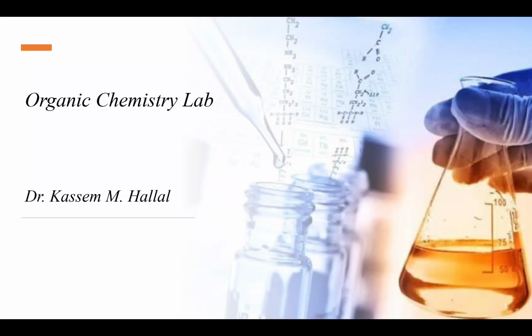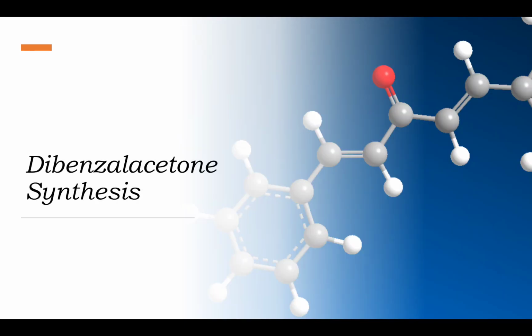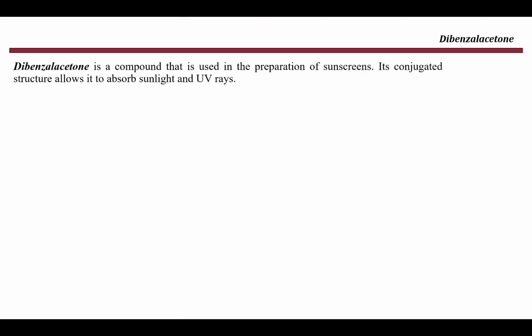Hi, welcome to another video in the Organic Chemistry Lab series. In this video, we will talk about the synthesis of dibenzalacetone. Dibenzalacetone is a compound that is used in the preparation of sunscreens.